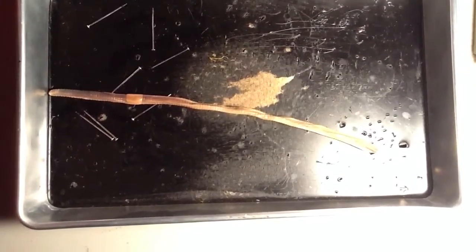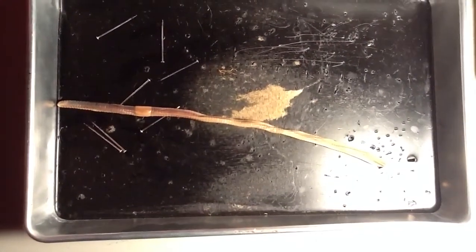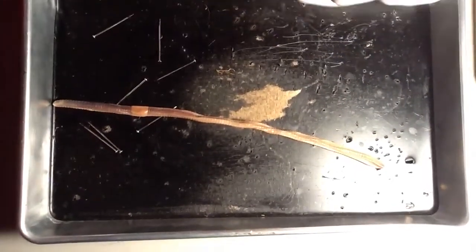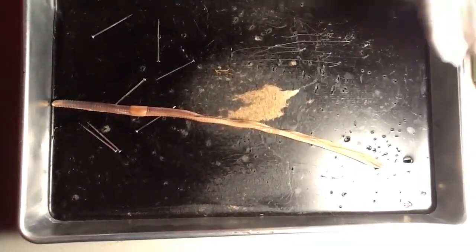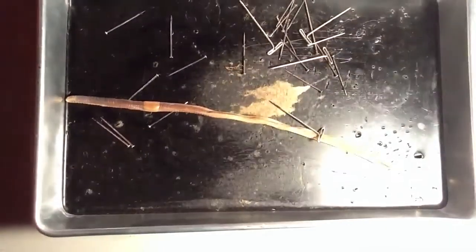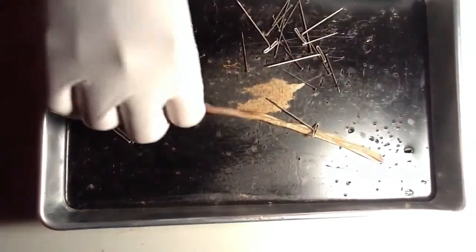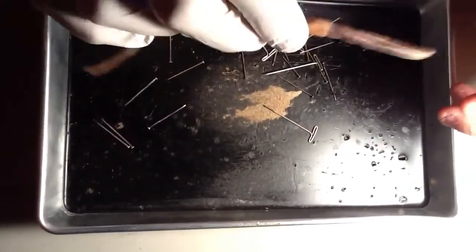First thing we're gonna do is take out scissors. I need scissors. Kits used to come with these droppers. I have no idea why. Anyways, I need pins, lots of pins. So I'm gonna do the same thing, dump out all the pins. All right. With me so far? Okay. Now notice I'm only wearing one glove. I'm gonna show you why in a second.